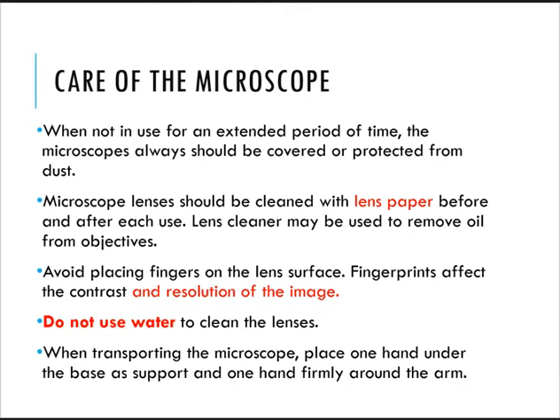When not in use for an extended period of time, the microscope should always be covered or protected from dust. That's why in our stockroom, if you have noticed during face-to-face classes, the people from the stockroom usually cover your microscopes with a dust cover to help prevent dust from coming in.